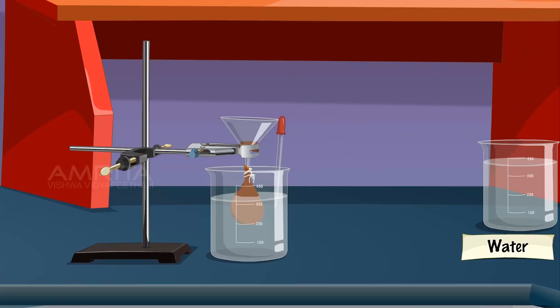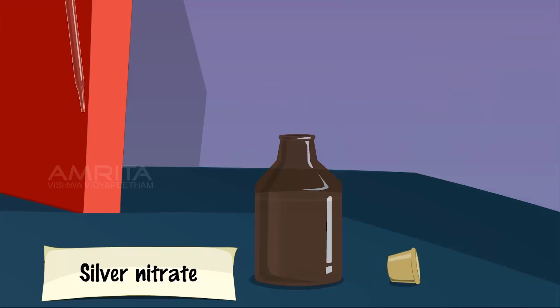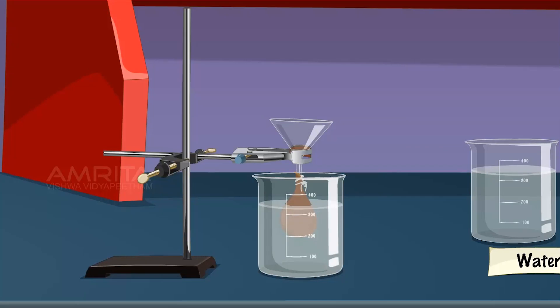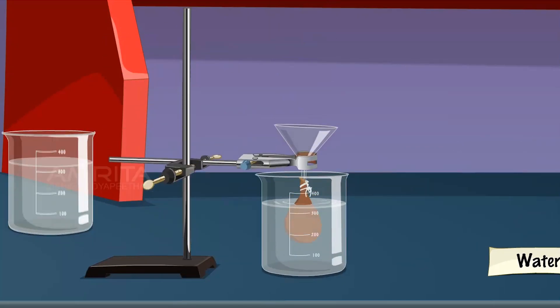After half an hour, take a small amount of water from the beaker using a dropper and transfer it into the test tube. Take a few drops of silver nitrate solution using a dropper and add it into the test tube containing water. A white precipitate of silver chloride produced immediately indicates the presence of chloride ions in water. Replace the water in the beaker with fresh distilled water and allow it to stand for 10 minutes.